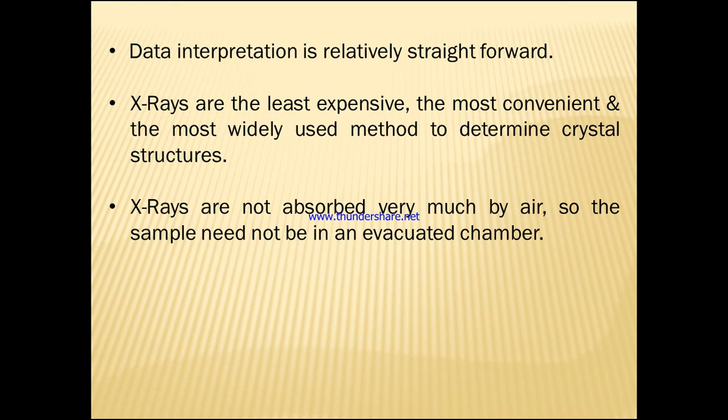X-rays are not absorbed very much by air, so the sample need not be in an evacuated chamber. This is an advantage. Because X-rays cannot be absorbed by the air, we do not need an evacuated chamber here.